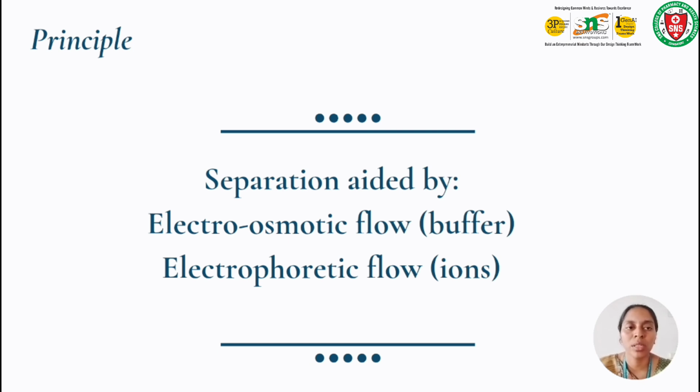And if we have a neutral species, it will also finally be recovered from the capillary tube, because there is an electroosmotic flow. But in other kinds of electrophoresis, the neutral components will not move. In electroosmotic flow, the components that have a faster migration rate will reach the detector faster, but the components with a lower migration rate will reach the detector slowly. The neutral species will finally, at last, reach the detector.